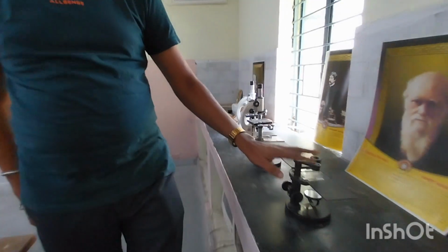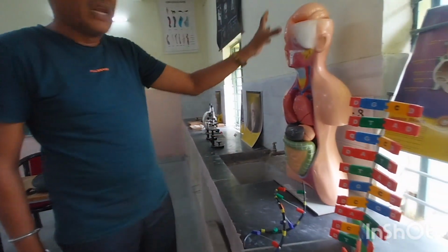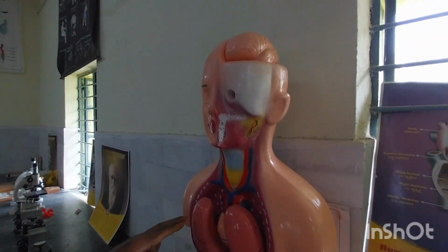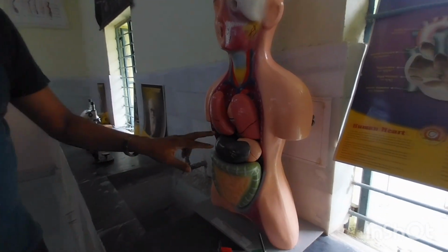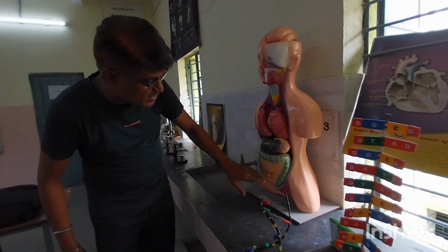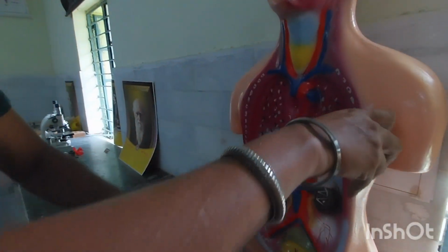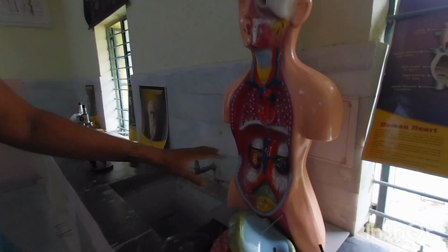This is the dissecting microscope. And here, see here, this is the model. This is called the torso model. And here internal body parts are shown. This is the brain, eye, lungs of a human being. Here the heart of a human being. Here liver, stomach, here large intestine, small intestine, different body parts here also. And also we can see the internal kidneys here. See here the kidneys also. Kidneys also we can see here internally.